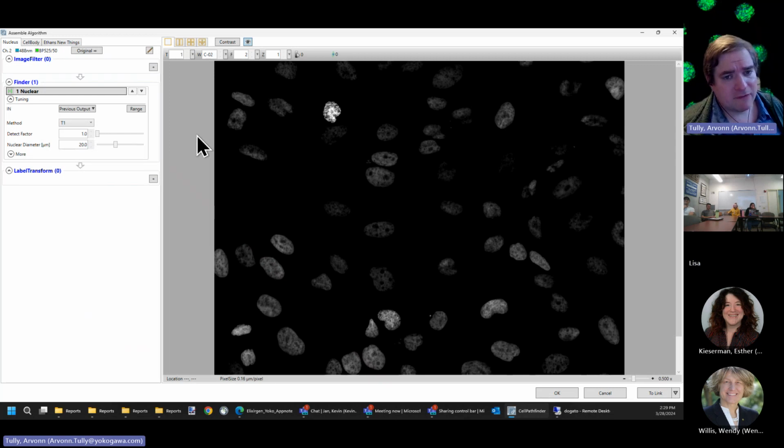What CVACE is, is a separate program which controls the CQ1 software and CellPathfinder and links them together. And it is a multi-pass software. Basically, CQ1 scans a slide or a well to find something interesting, like say a spheroid, like my background here. So it'll find spheroids, usually at low magnification.